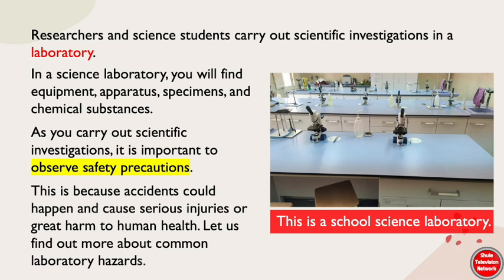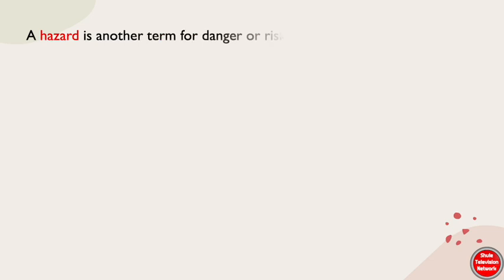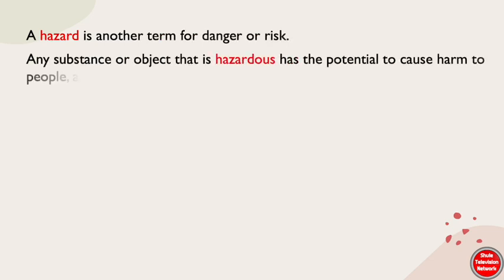Let us find out more about common laboratory hazards. A hazard is another term for danger or risk. Any substance or object that is hazardous has the potential to cause harm to people, animals, plants, as well as the environment.